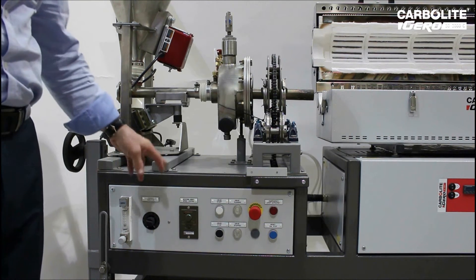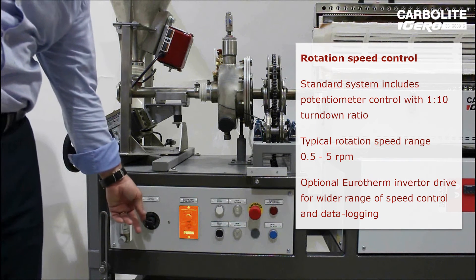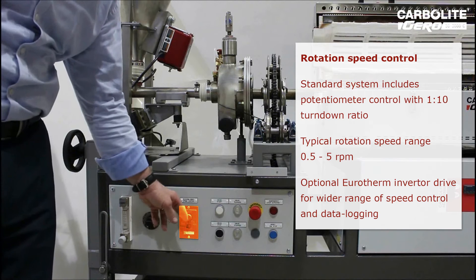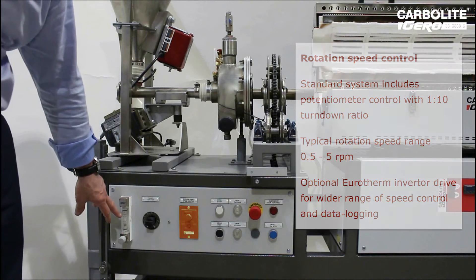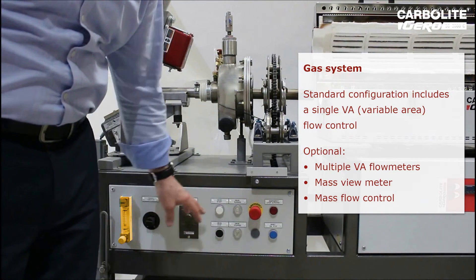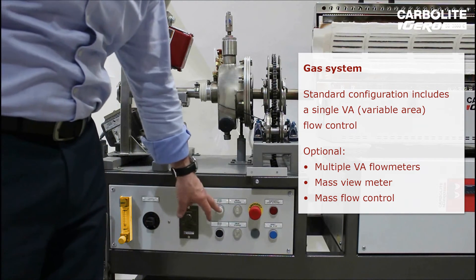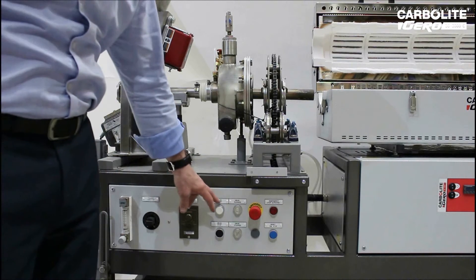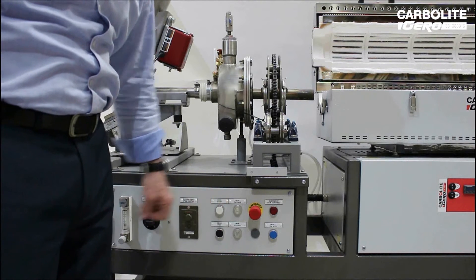The rotating tube furnace control panel comprises vibrator feeder control, rotation speed control, gas inlet, and emergency stops. It is a simple system which links the drive to the furnace operation, so should the furnace be open, it isolates the drive system.